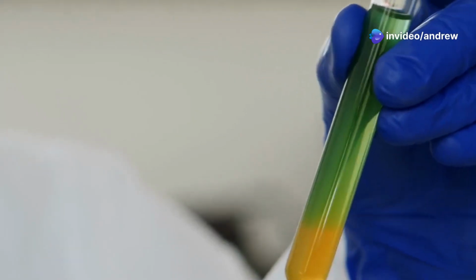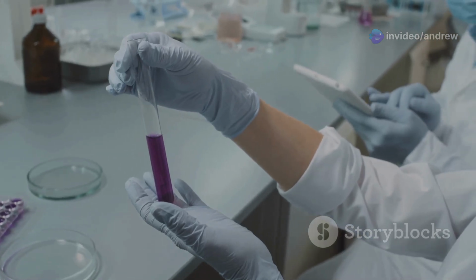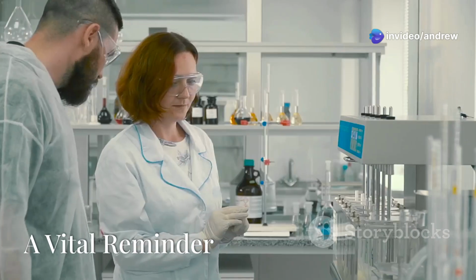Observe the sample closely for any color changes. If marijuana is present, the solution will turn purple. Finally, add a small amount of chloroform to the test tube and shake gently. If marijuana is present, the chloroform layer will extract the purple color, forming a distinct layer at the bottom of the test tube.